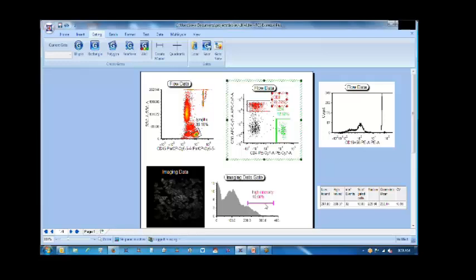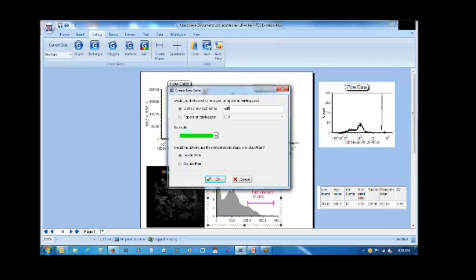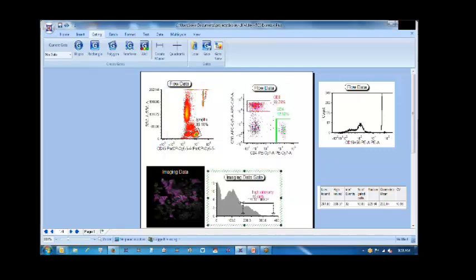I have a marker drawn here on a histogram of cytoplasmic staining intensity. What I'm going to do is convert that histogram marker to a gate that I'll be able to see on the image at left. Let's call this high intensity. I'm going to give it that hot pink color so it shows up really well. You can see on the left now we're highlighting the high intensity cytoplasmic objects. I'm going to move the marker around, and you see that it live updates.